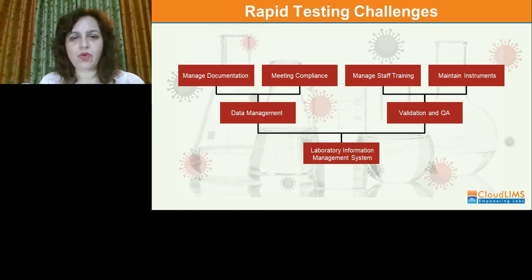As more and more point-of-care test kits are now becoming available around the globe, including in the United States, as a part of FDA's emergency use authorization process, or EUA process in short, one bottleneck appears to be easing up. While we understand that rapid testing is important, many countries have not been able to keep up with the demands of testing.